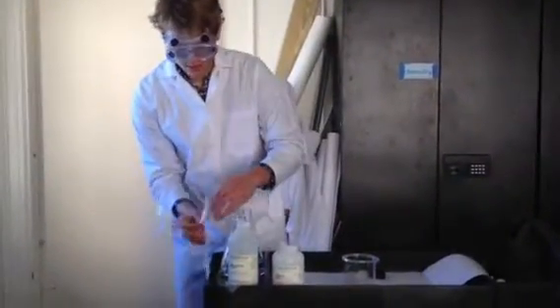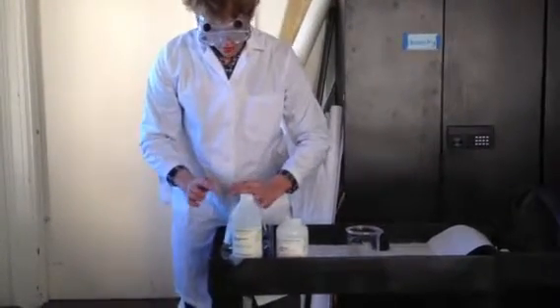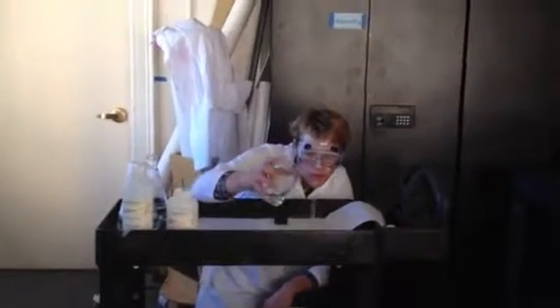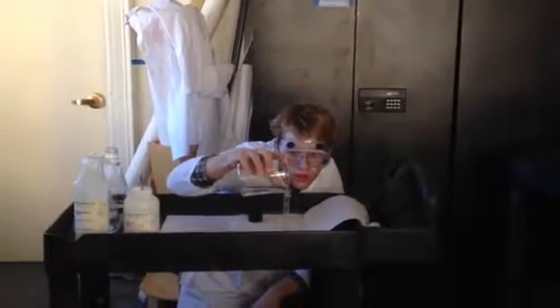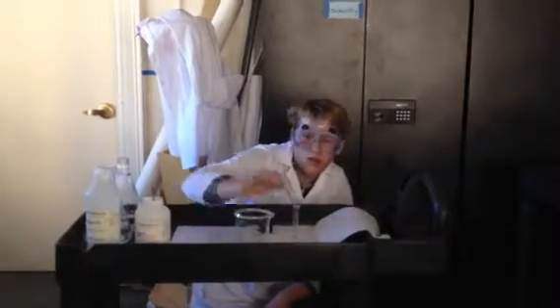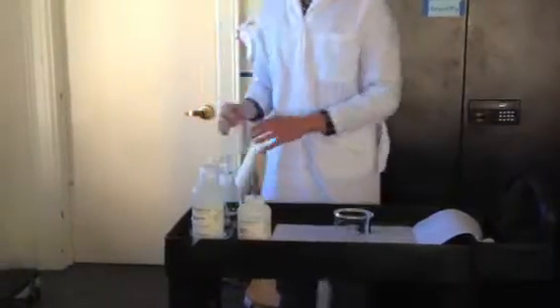And then what we're going to do is mix this up. We're going to stop it actually for a minute. Just kind of let it sit there. And then we're going to fill this other flask B with 5 milliliters of sodium hydroxide. Okay. So now we have the two reducers and the oxidizers changing, but we're not going to see anything yet.